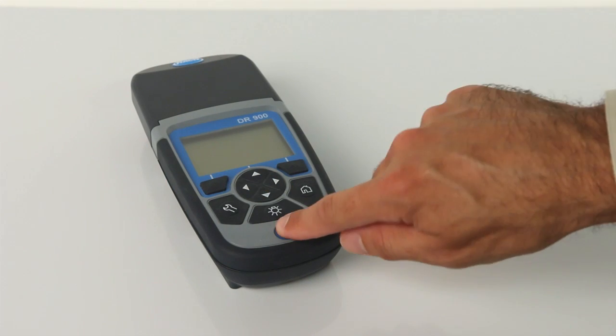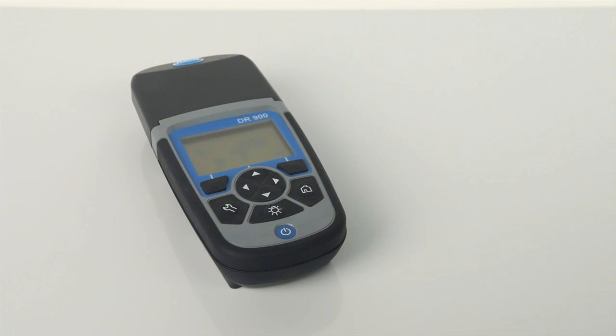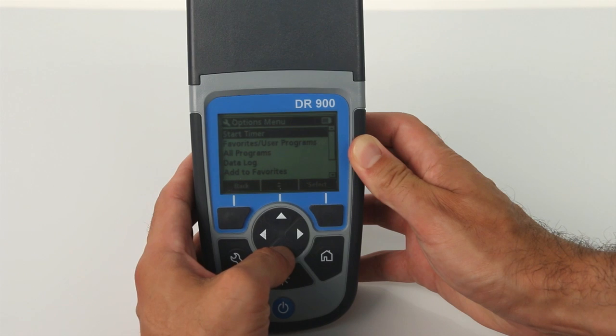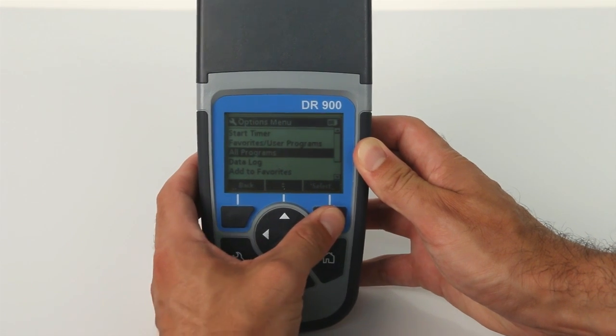Press the power button to turn the meter on. The display will show the last test performed. Press the options button and scroll to all programs, then press the select button.